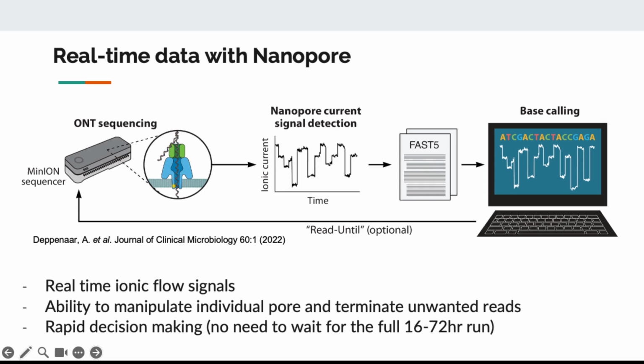But if you want to have the answer very fast, the software that decodes the signal has a fast and a slow mode. So if you use the fast mode, you can get the result within 6 or 7 hours. So it's a time scale where you can use it in a hospital. You can get a blood sample or urine sample from the patient, run it on a nanopore, decode the data in real time, and then get the recommendation to the doctors within half a day.